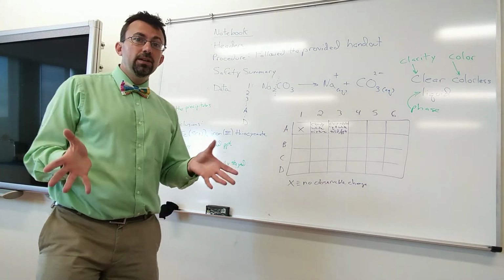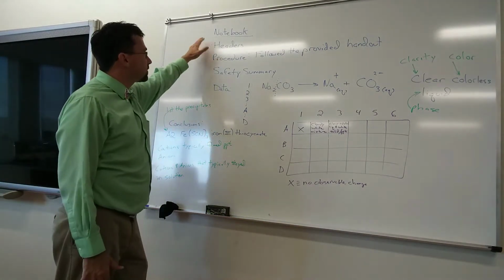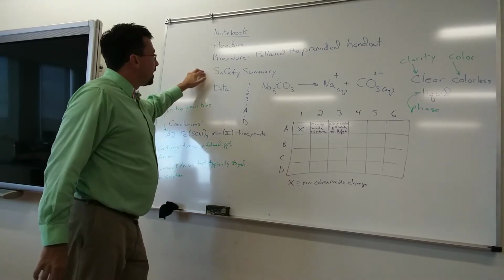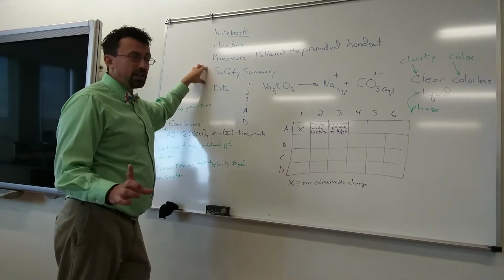So what are you going to do while you wait? We'll get our notebook set up. So same as always, fill in your headers, title of the lab, lab partner, date, those kind of things. For the procedure, just put a statement that you followed the provided handout. I will talk about safety at the beginning of every single lab, so summarize what was said there to make sure that you paid attention and you're being safe in lab.